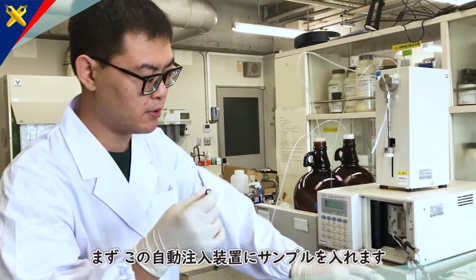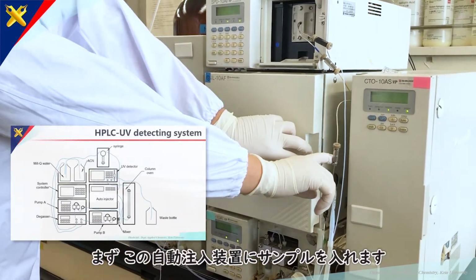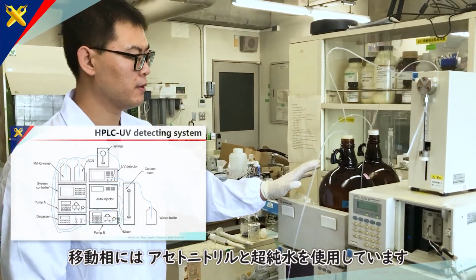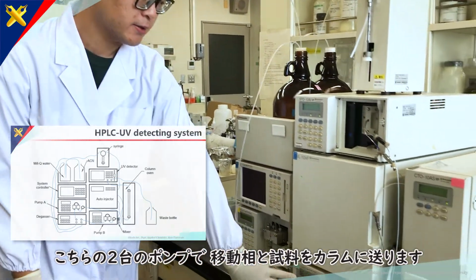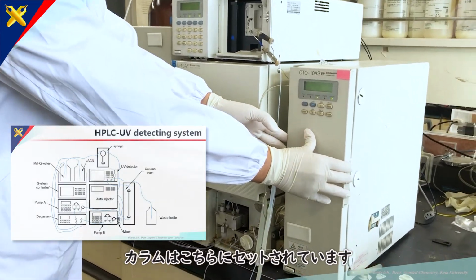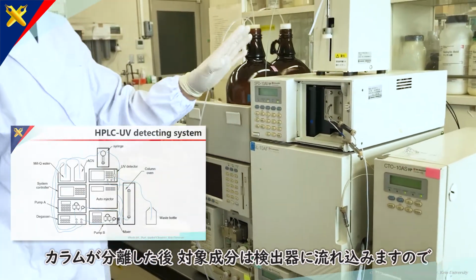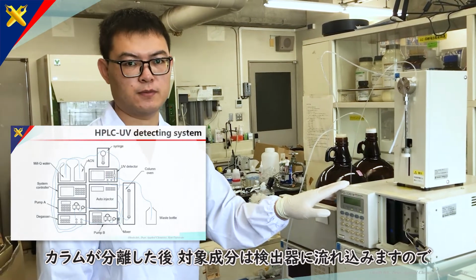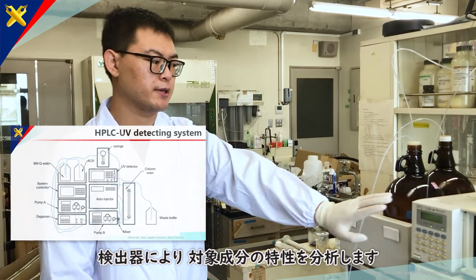So we put these samples into this auto-injector box, put it in here and turn it on. And this is our HPLC detecting system. We use Milli-Q water and ACN as mobile phase, and here are two pumps. They pump the mobile phase and the sample into the column. The column is sitting up here. And after the column separating, the pollutants flow into the UV detector.